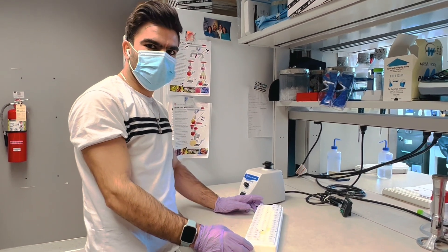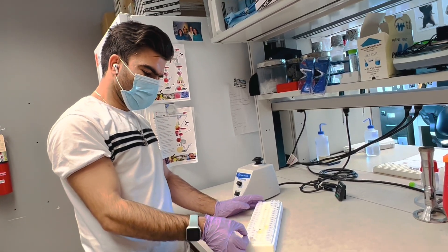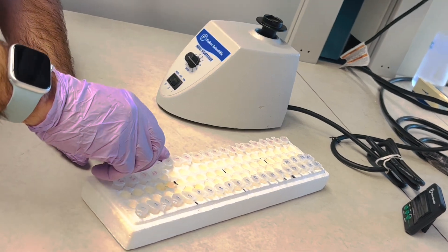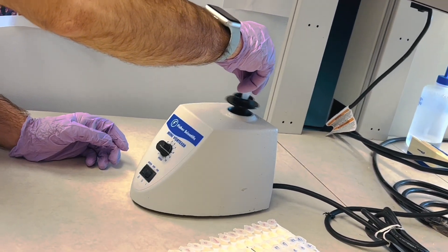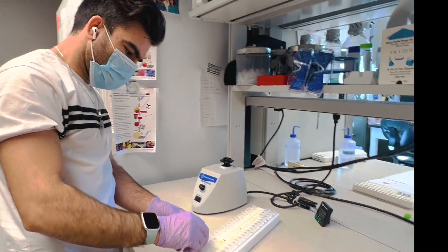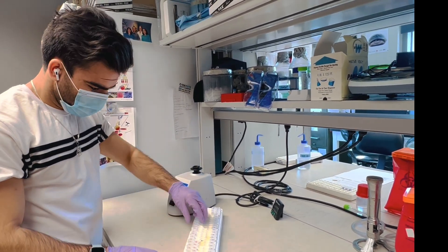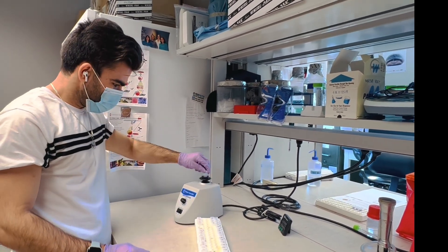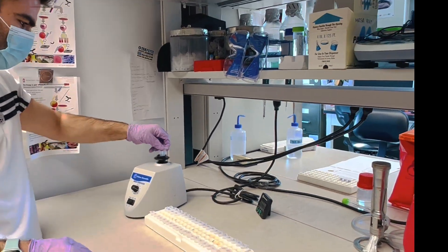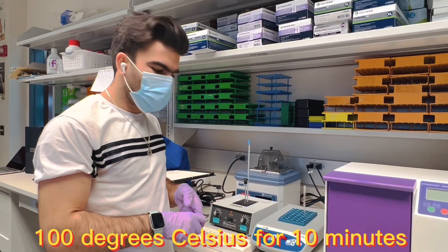Once you've finished inoculating the bacterial isolates into the culture tubes containing double distilled water, the next thing you need to do is vortex them.